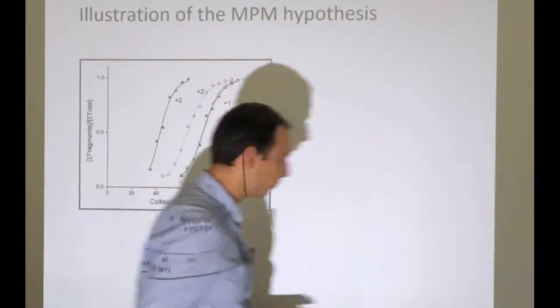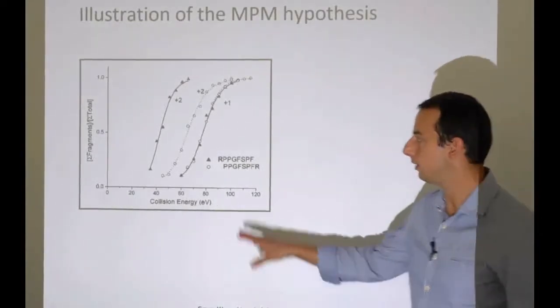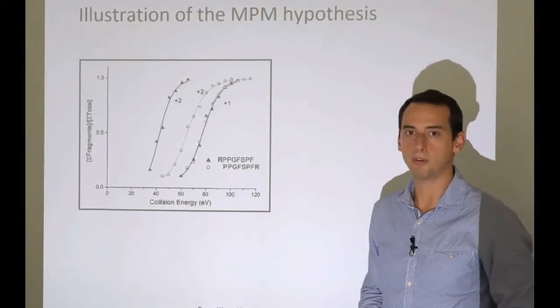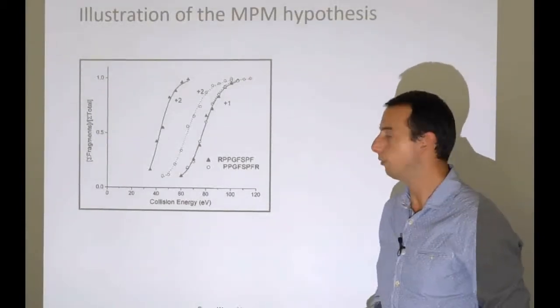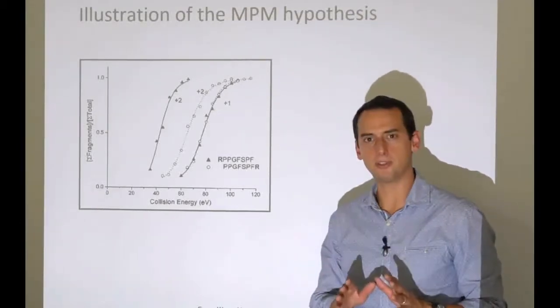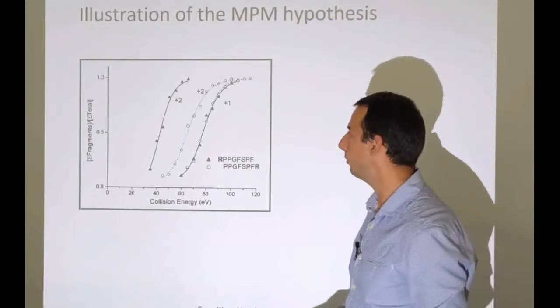Now, this theory was proven by a series of very elegant papers by Wysocki et al., and earned Wysocki the ABRF award amongst many other awards, and rightfully so, because this is a very interesting study that is very simple to understand and is very elegant in its design. Let's have a close look at how this works.